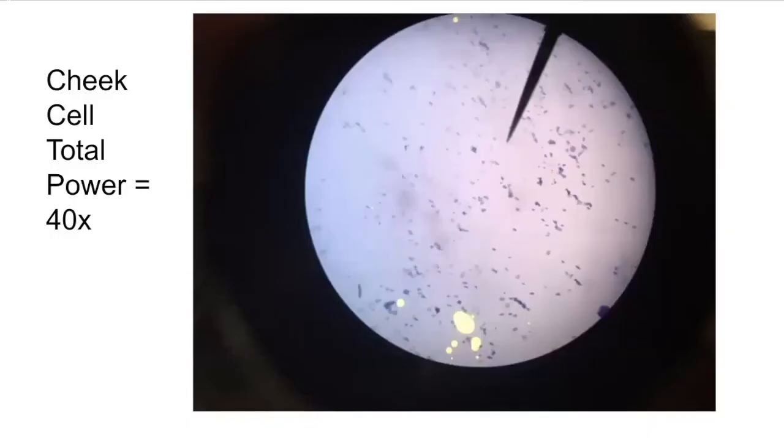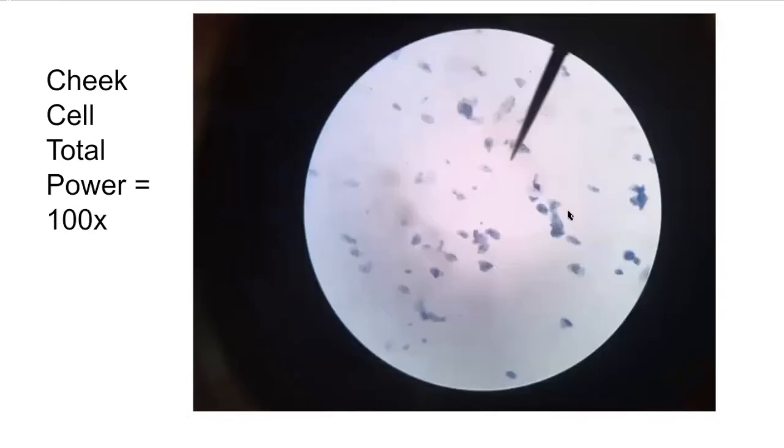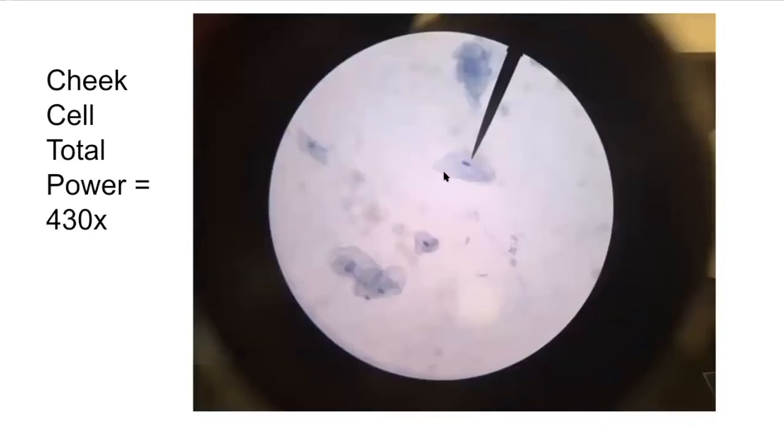If we look at our cheek cells on low power, they don't look like very much, but each one of these little blue dots is a cheek cell. If we increase the power, you can see a bit more detail. We're starting to see the nuclei in these cells. And if we increase to even more power, you're able to see in pretty good detail the nucleus, the plasma membrane. Animal cells do not have a cell wall, so there's no outer coating to these, which is why they have lots of different shapes and not just one type of shape. We can also see the cytoplasm inside of this cell.